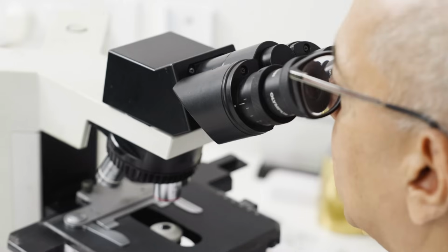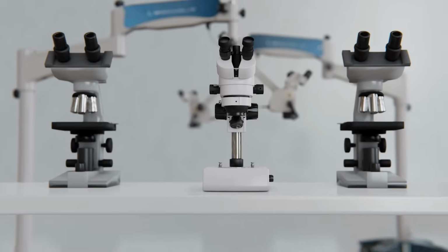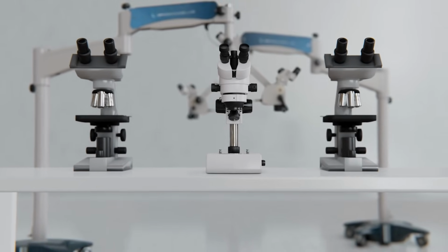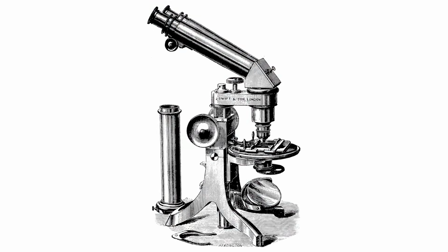As a pathologist, the microscope is perhaps the most endeared, loved piece of equipment that a pathologist can own. When I was studying at Grant Medical College, my first teacher in pathology, Dr. Karve, helped me procure a microscope from the scraps that lay within the department, a very good quality microscope which did not have a light source as this one has. It had a mirror which would be used as a light source. But Dr. Karve taught me the importance of having a good microscope and how to look after it.